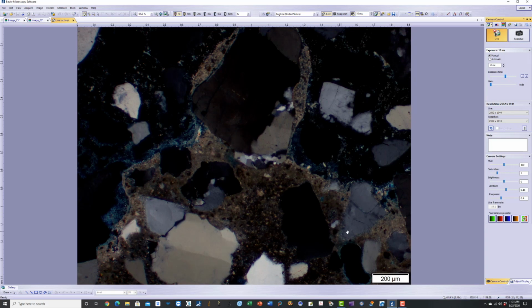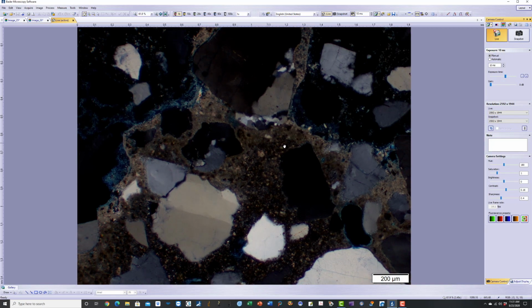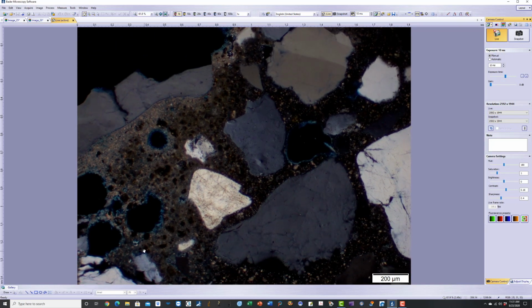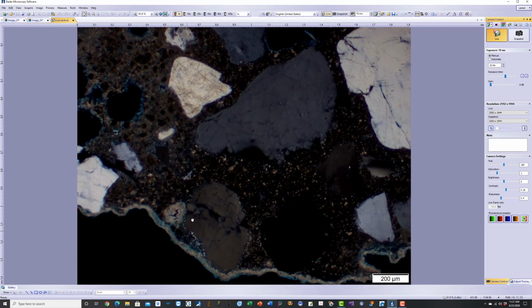And the dense paste also got carbonated because atmospheric CO2 came down through the interface between the mortar and the slate paver to eventually carbonate even the denser areas of the paste. So there was a ready access of not only moisture but CO2 to cause the carbonation.